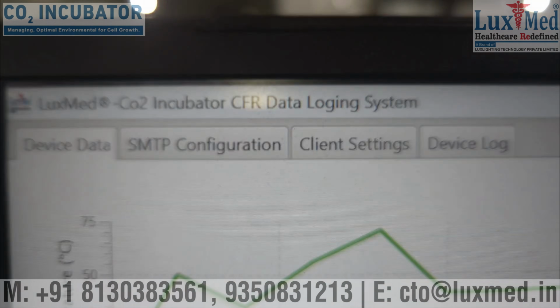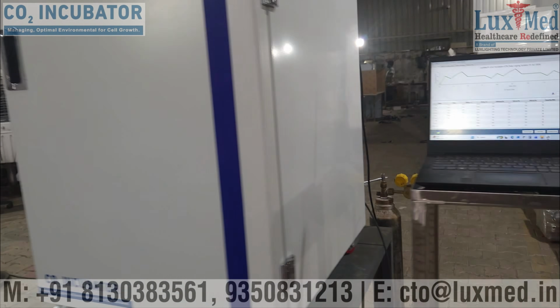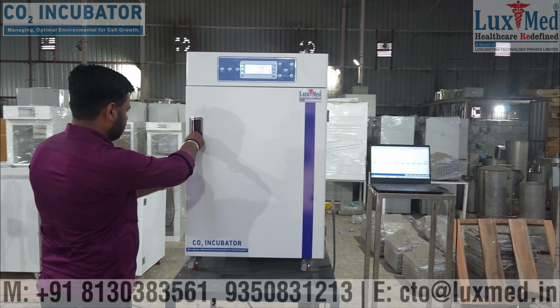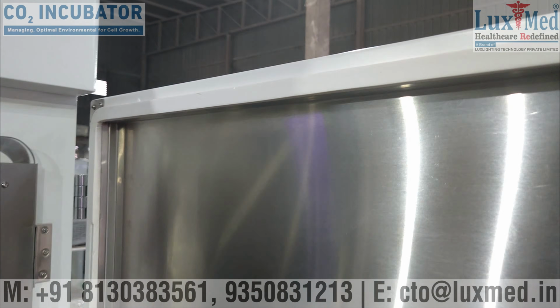How CO₂ incubators work. CO₂ incubators control several key parameters to maintain optimal conditions for cell culture. Temperature. They maintain a specific temperature, typically 37 degrees Celsius, which is optimal for many mammalian cell types. Humidity. High humidity levels, around 95%, are maintained to prevent the cells from drying out.